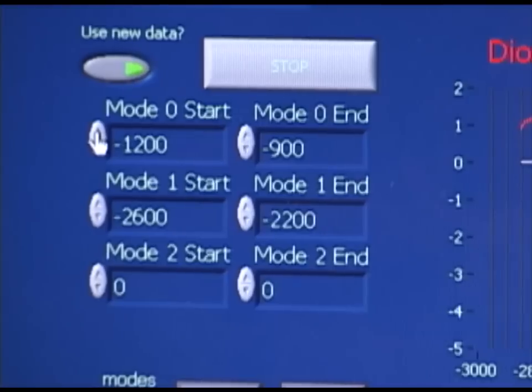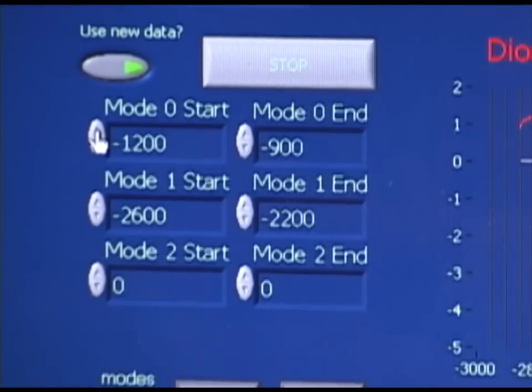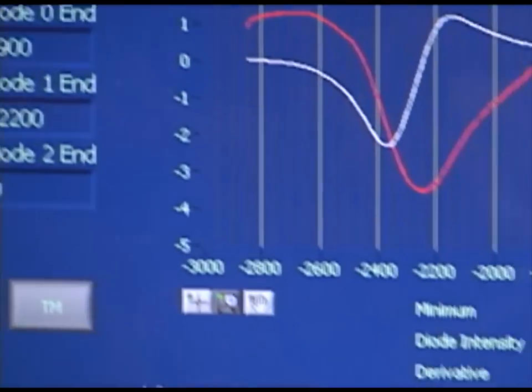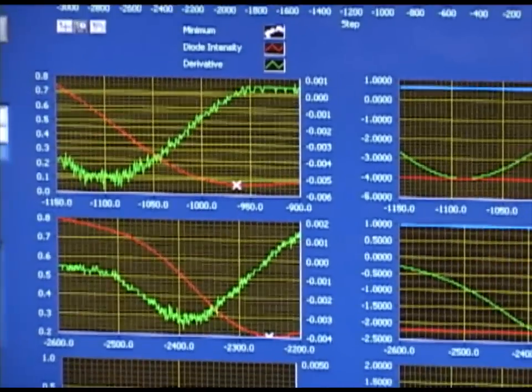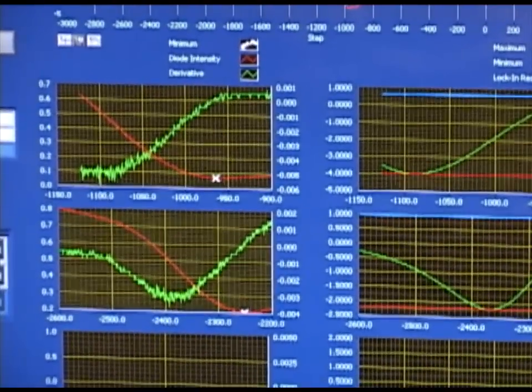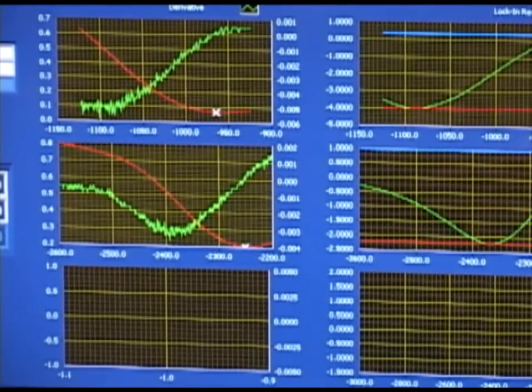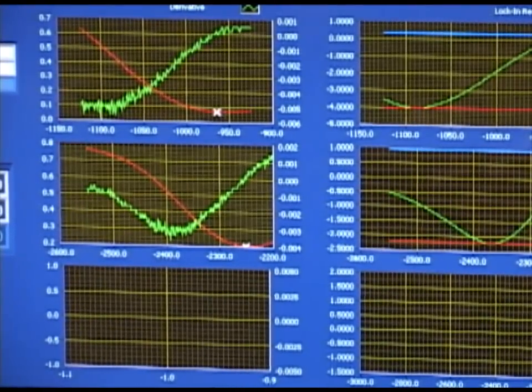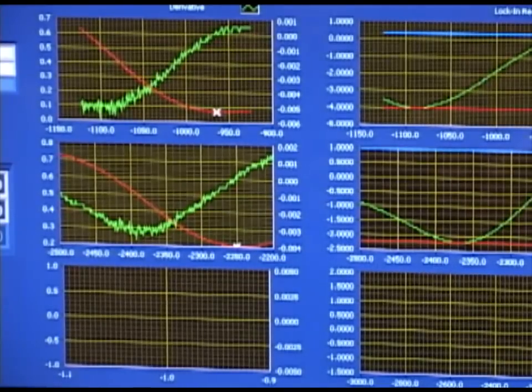To do this, I click these buttons corresponding to each mode to fine adjust the step mode number. As I click these buttons, you'll see the derivative graphs change. Now the graphs capture one full amplitude from peak to the trough of the derivative of both the lock-in amplifier intensity and the diode intensity.